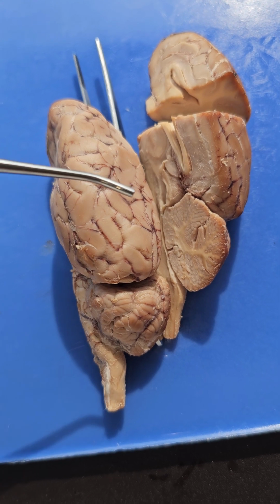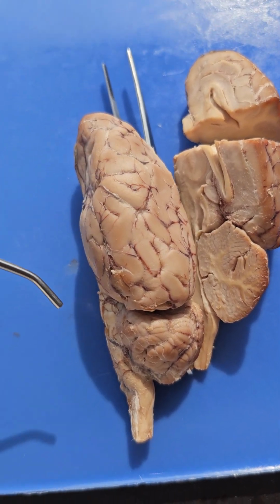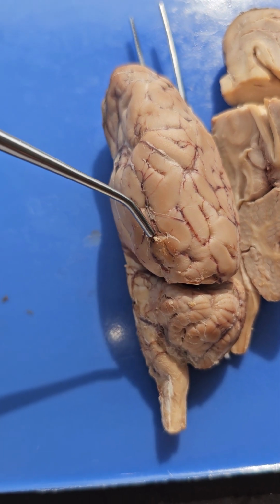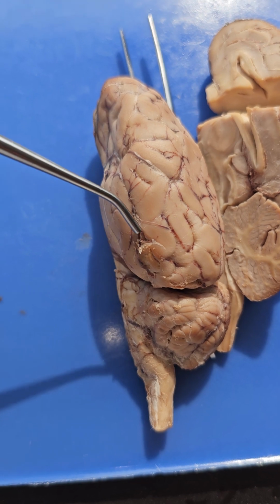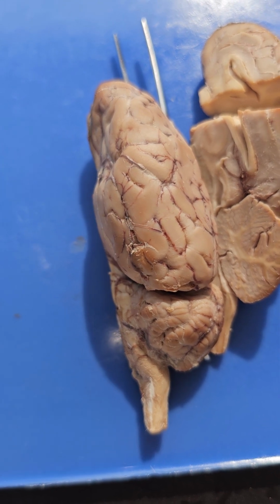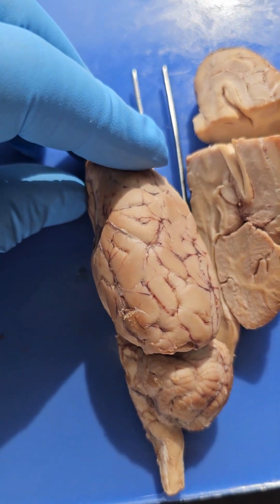Here we have the brain. The dura mater is already removed. There's a very thin layer of arachnoid mater and pia mater that you can sort of see right about here. It covers and protects the brain.